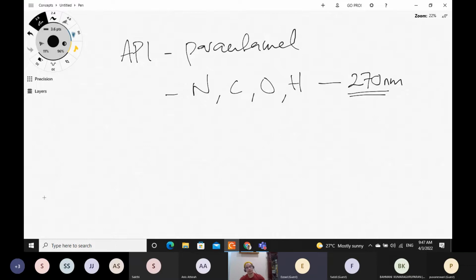So kalau dalam makmal, production department hantar satu batch ubat Panadol. So kalau kita nak identify betul ataupun tak betul itu adalah Panadol, kita boleh buat spectroscopy test. Kita grind dia jadi powder, dissolve dalam solvent, and then masukkan that solution dalam UV spectrophotometer, dan tengok dia absorb light paling banyak dekat berapa nanometer.